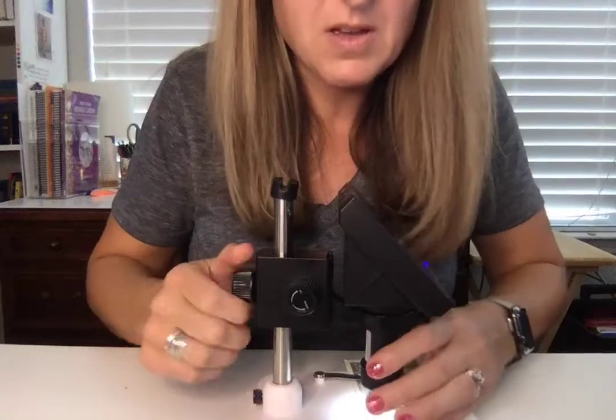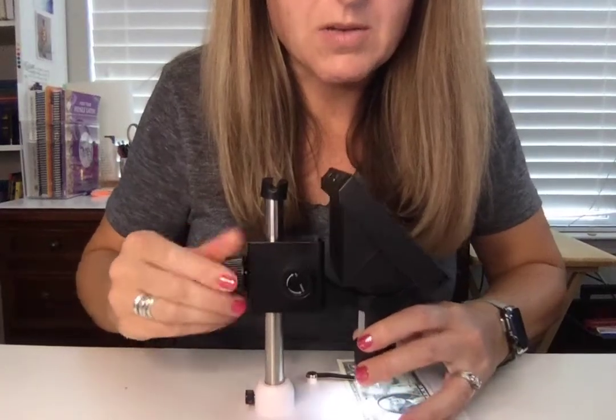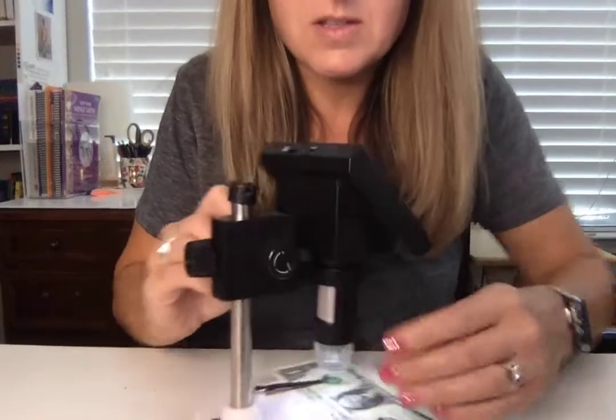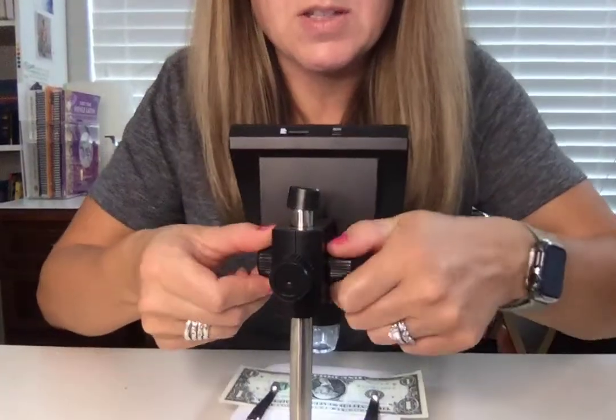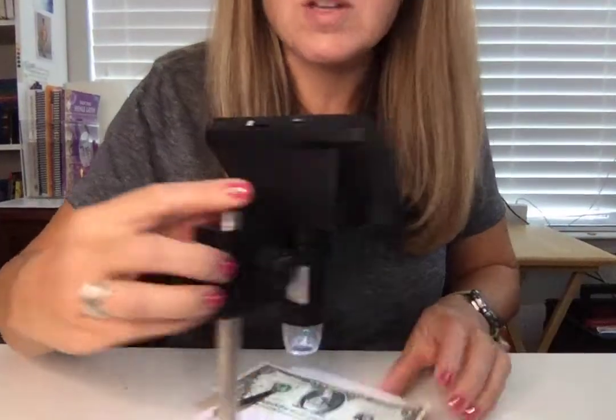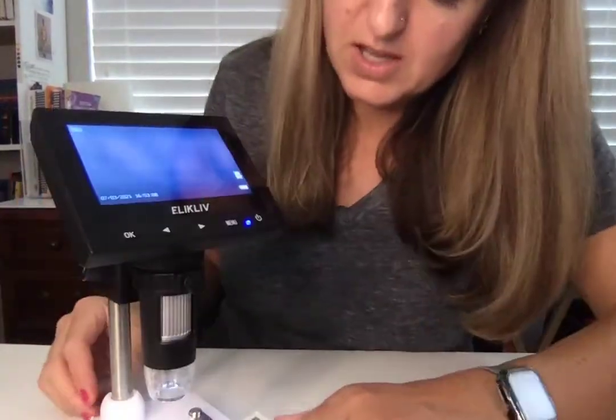You can see it going up and down. Also, these knobs on the side can raise and lower it as well. So it's actually got quite a bit of adjustment that you can do to it, which is excellent.